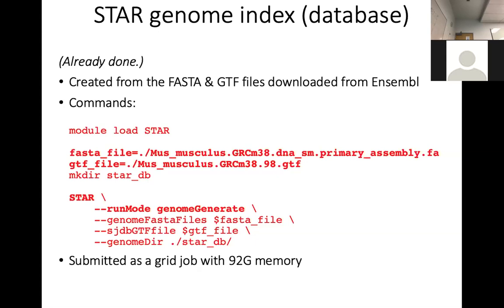you don't need to. Oh, it's actually back to the genome index side.